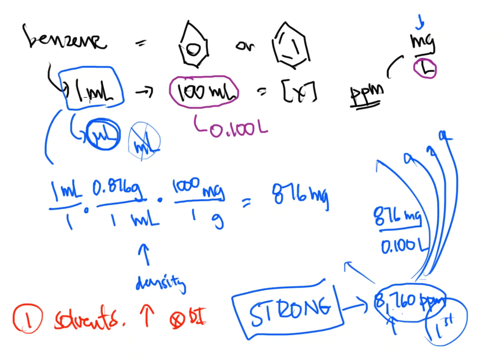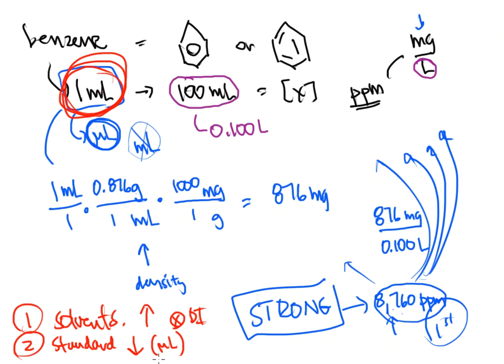Number 2, take a look at your standard amounts. These standard amounts are pretty important because those are going to be extremely small. So my standard or my component is going to be pretty tiny, and we're thinking microliters most of the time here. Now, I apologize. I know that my U looks a little bit like the M sometimes, but that's just me getting careless. All right? So that's the proper way to make standards in the GC.